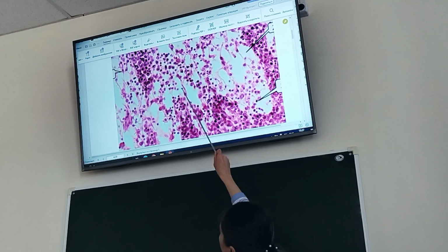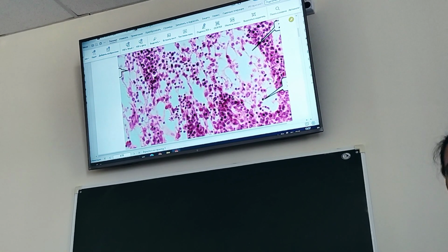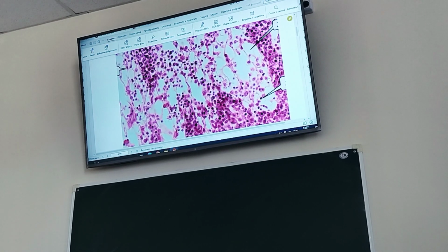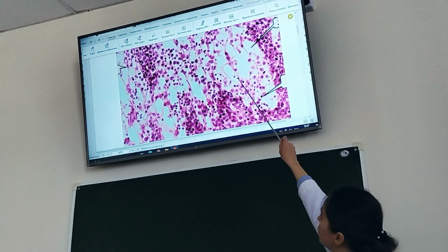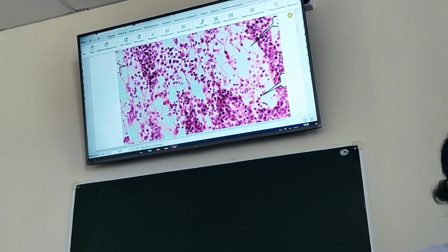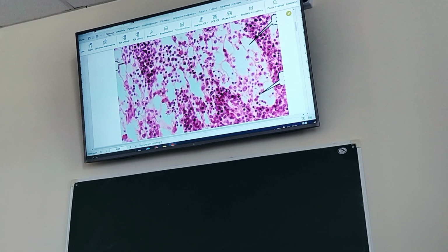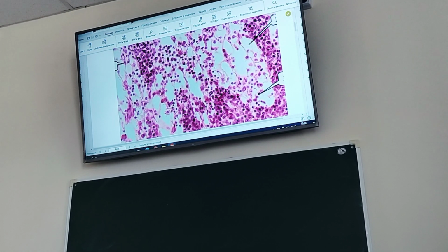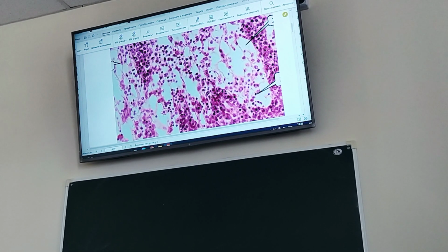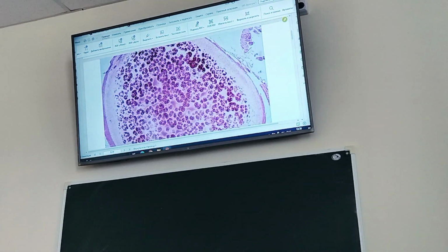I can see also many small rounded nuclei. These are lymphocytes. So reticular cells are branched cells with processes that make up a sponge-like architecture. In between these processes, like in pockets, I can see lymphocytes. That is all, quite enough for this image, with no details.